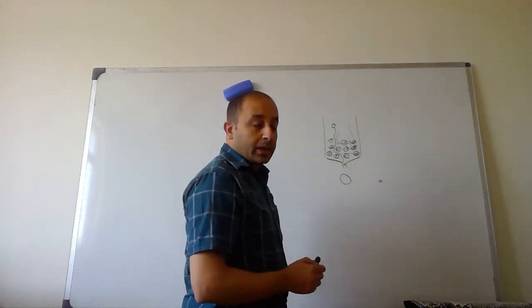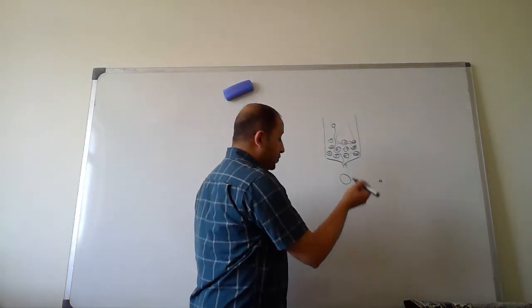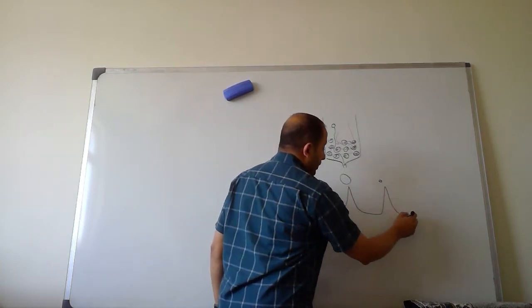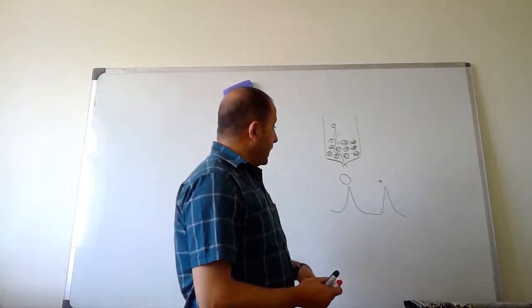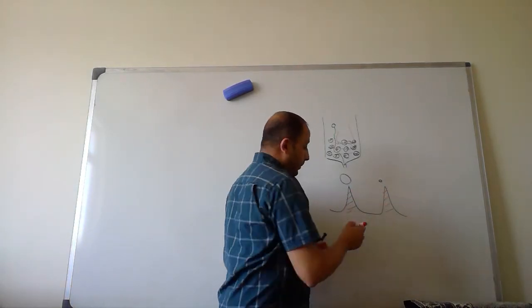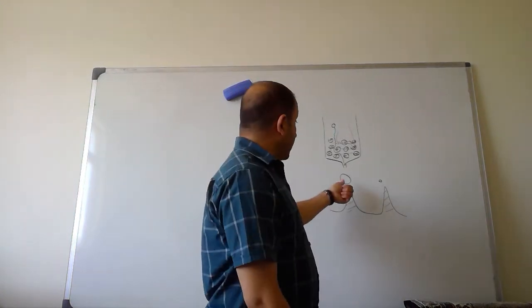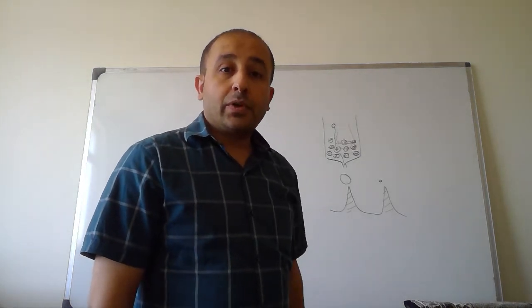If we monitor by certain detection instruments or tools, we will detect that the large molecule goes first, then the small molecule goes behind the large one. The area under the curve of detection will rely on two things. First of all, if we detect the elution by UV, it will rely on the light absorbance of the molecule.